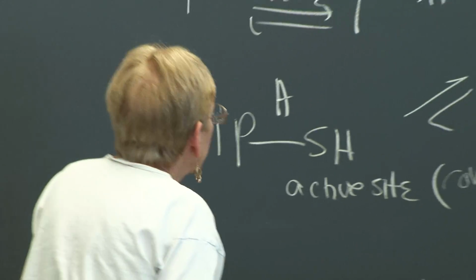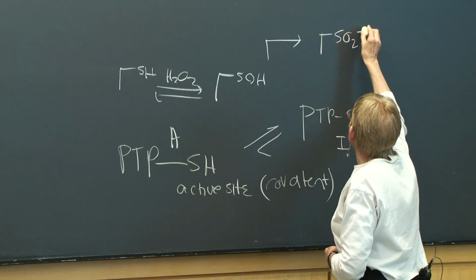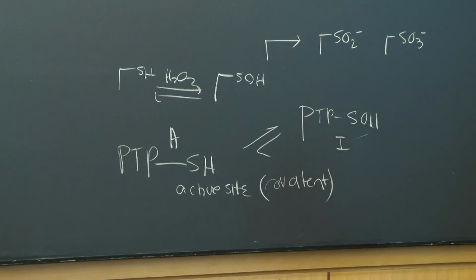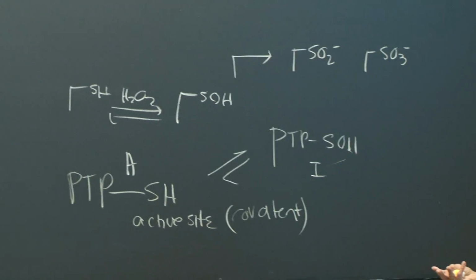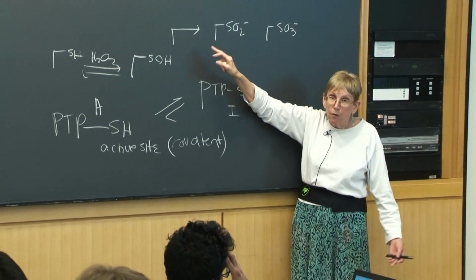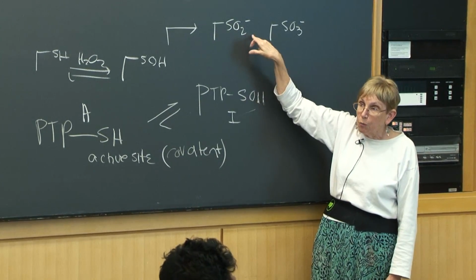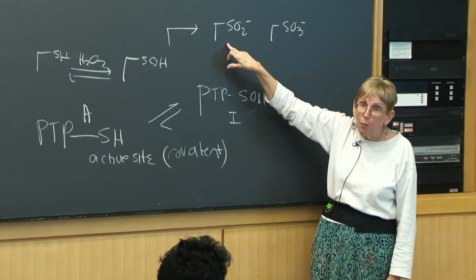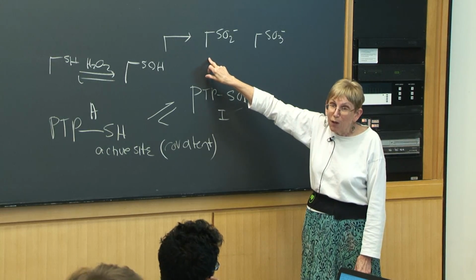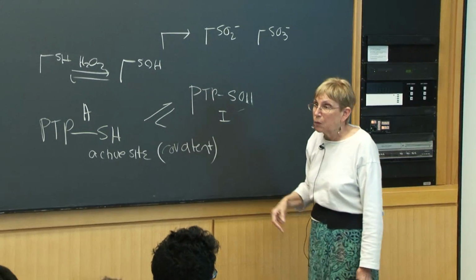Okay, so what we talked about last time, in addition, is hydrogen peroxide can oxidize this to these things as well. It's much slower. How would you look for this? So one explanation is that you have some competing rates. Again, we don't know anything about it, but that you had changed it and that the dimedone no longer reacts with these forms based on the mechanism we described last time. So that's a possibility. And if you read the supplementary information, how much you distinguish between this and this.